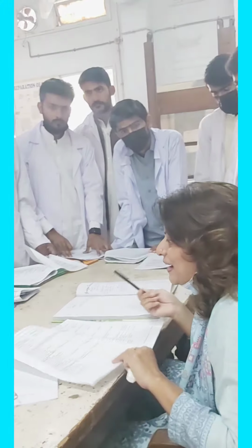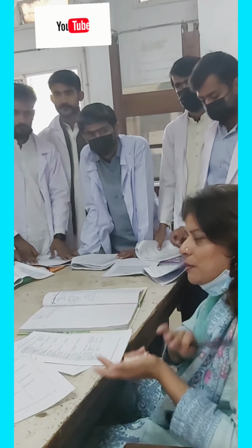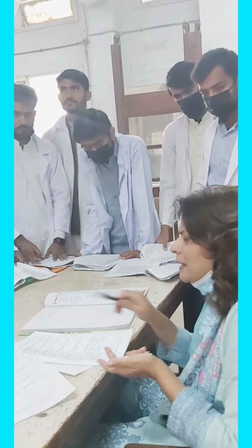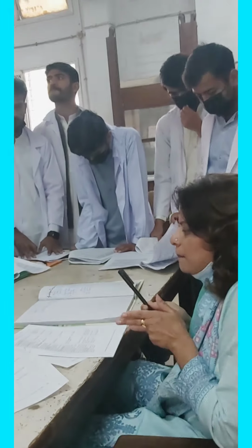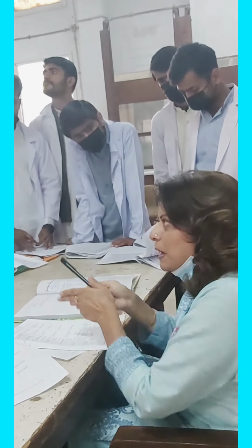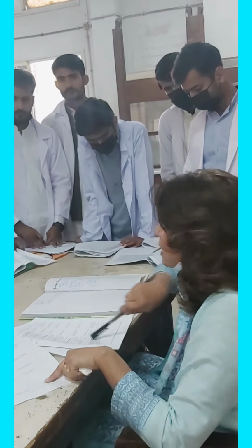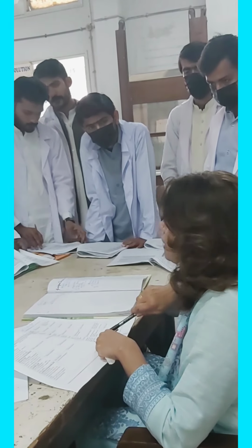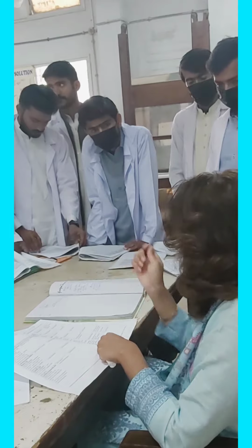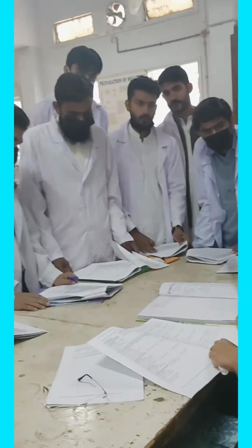But what happens when it's an unknown compound? Then we have the previous results and the previous data, and on the basis of that data you will know that it contains this thing. Your compound will find its own direction. Keeping that direction in your mind, you are going to select which tests are supposed to be done, as our compound has given us these results previously, right? Are you clear now?